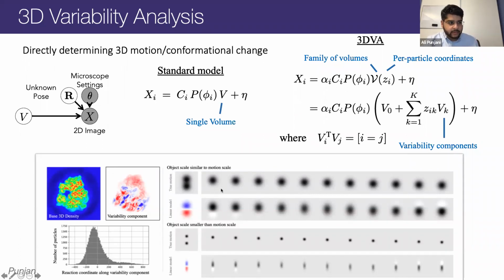In this toy model, we may have 1,000 pixels or something in total in the image. In 3D structures, we may have millions of voxels in our representation of the density. And so the size and computational ability to represent these objects or other statistics about them becomes impossible in very large dimensional spaces. Hopefully that answers the question. All that, what I just said, is in a lot of detail in the paper. So if anybody wants to read it, it's hopefully a good explanation.